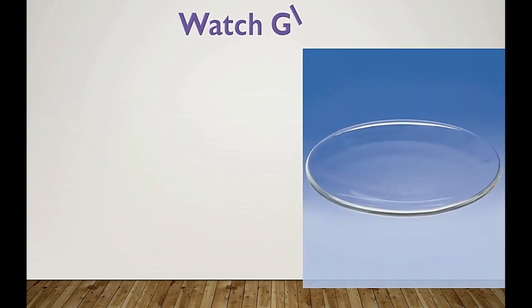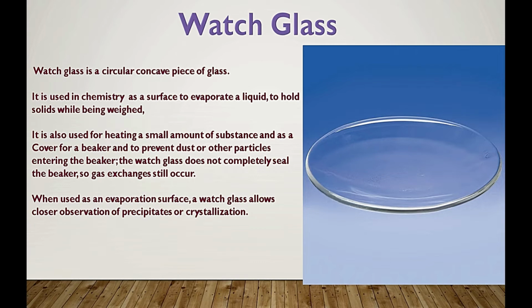Next apparatus is watch glass. It is a circular concave piece of glass. It is used in chemistry as a surface to evaporate a liquid or to hold solids while being weighed. It is also used for heating a small amount of substance and as a cover for a beaker to prevent dust or other particles entering the beaker. The watch glass does not completely seal the beaker, so gas exchange is still possible. When used as an evaporating surface, a watch glass allows closer observation of precipitates or crystallization.